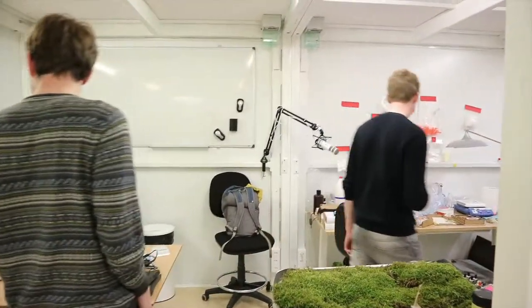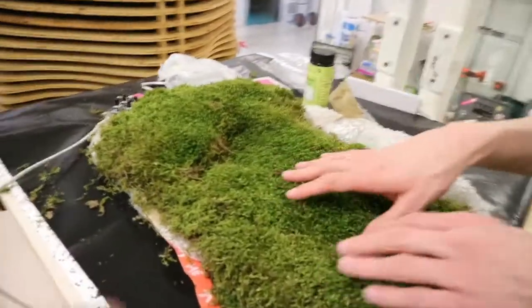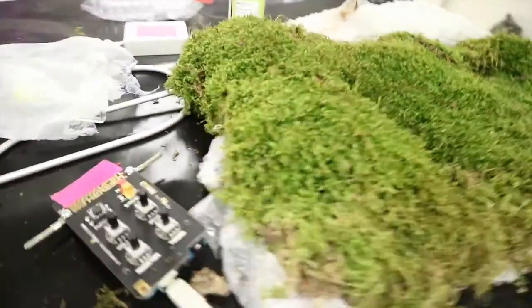Microscope. Electro-wetting over here. Pop-up lab. I think they've been here for a couple of days now, right? Looks like it. And what's this? I think this is moss that you can use to generate sound. It's a theremin board — like a keyboard for sound, but I think it's not connected at the moment.